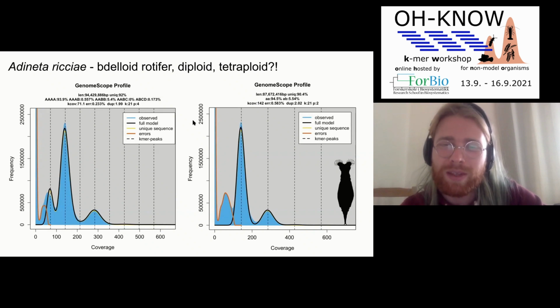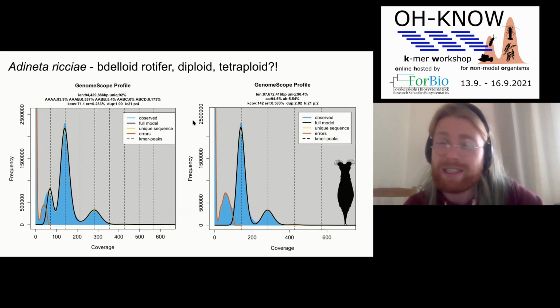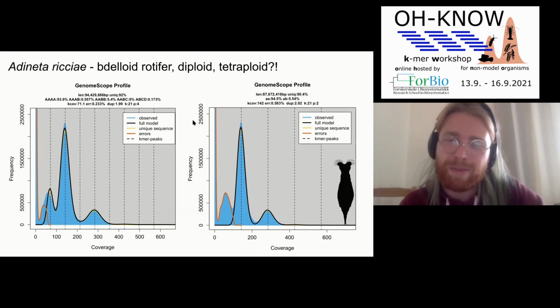So would you like to get the answer now, or would you be patient for later on? Because we do have a bunch of Kmer spectra that are from mixed tissues of different karyotypes, and it's quite fun. You're right. It creates peaks that are unevenly spaced. And basically, okay, perfect. So we will talk about it later.